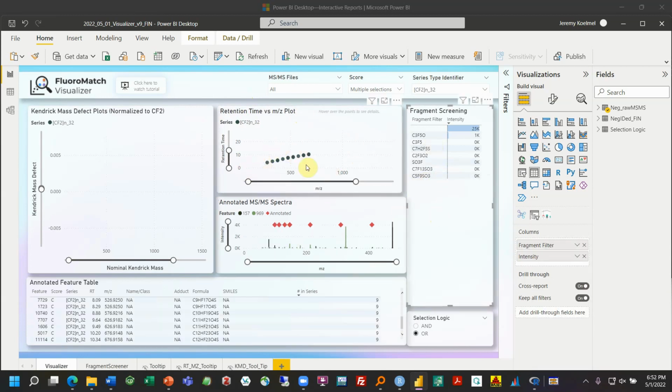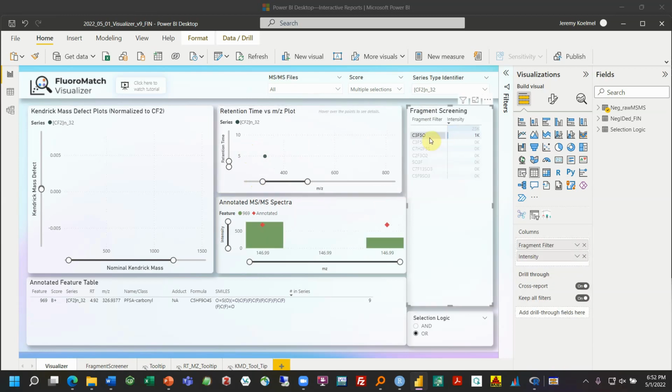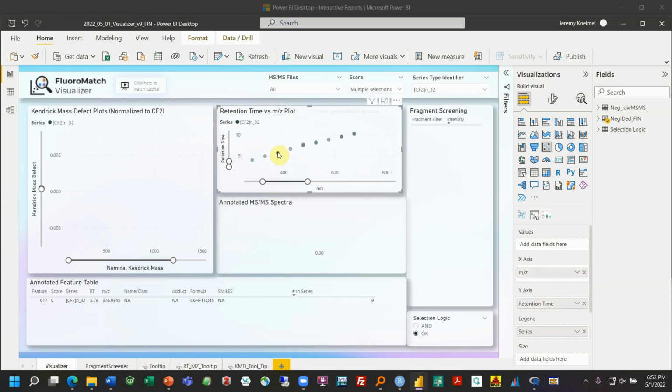Now it looks really nice in terms of its diagonal. It's perfect. This is what you'd expect. Some of those other ones look a little suspicious, although they might have a lot of isomers. This is an old AFFF mixture, so that might be what it is. This one doesn't look like it has too many isomers, although if we zoom in, we can see that there are some isomers here that are very close. And this is a very nice pattern. And then you can see, for example, C3F5, C2F3O2. So only one of them had that ether type linkage. So maybe not ethers. Let's keep scrolling through.